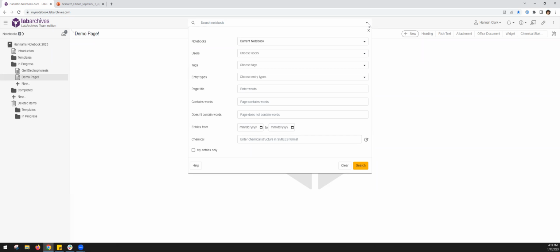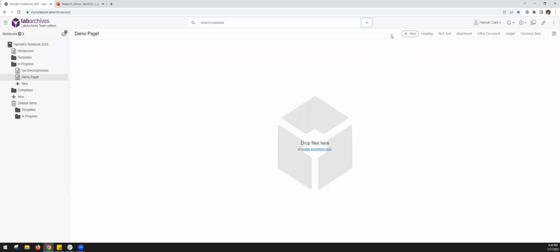Now, there are a lot of different filters that you can apply here, and search is the most valuable thing because often we talk with research integrity and scientific integrity folks. The hard part is finding the data. Once you find it, you can usually say, yep, there's the work. There's the data for figure 4 in this publication that was made.